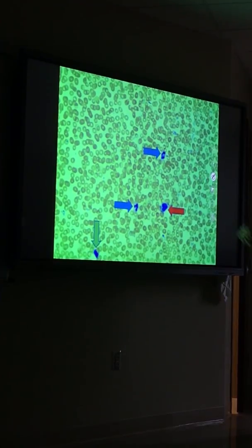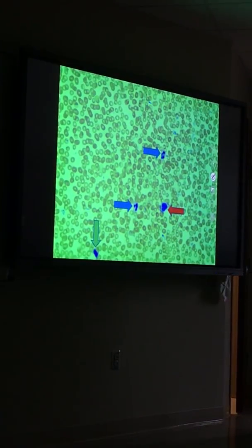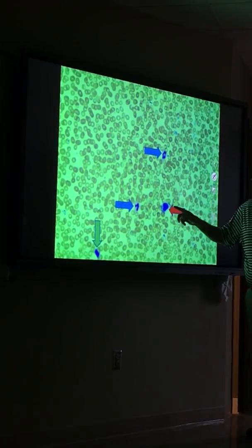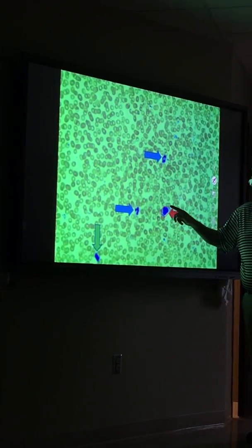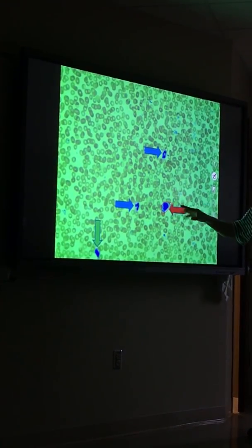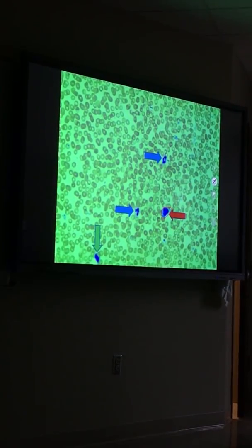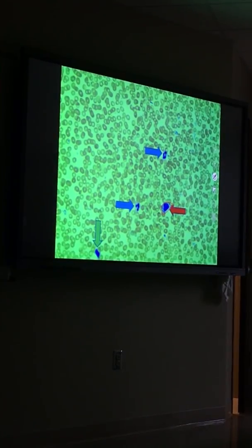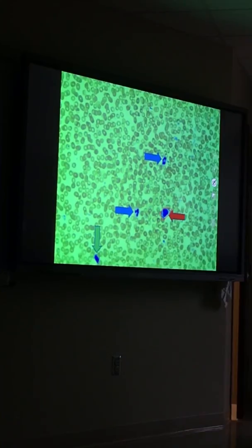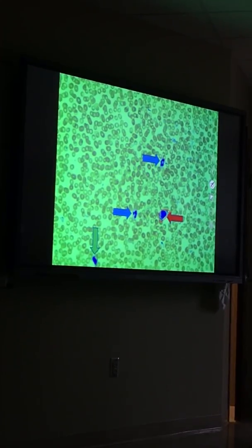The most common is what? Neutrophils. And they're going to have 3 to 4 to 5 lobed nuclei. We just looked at this. See how that one's irregularly shaped? So that edge is its cell membrane. And that one does have kind of a C shape, or I don't know what else you want to call it. C, butterbean nucleus. Okay, and then I'm always going to be the same.